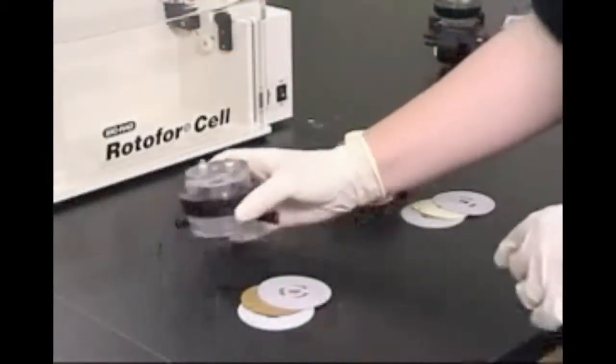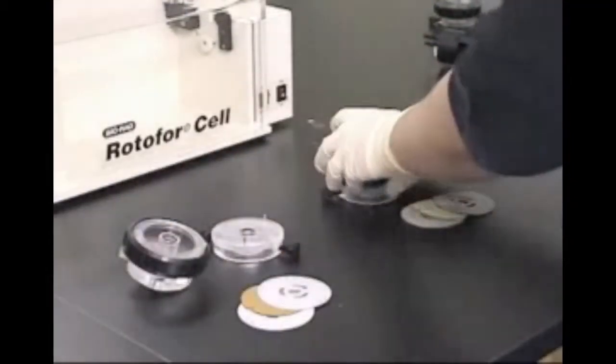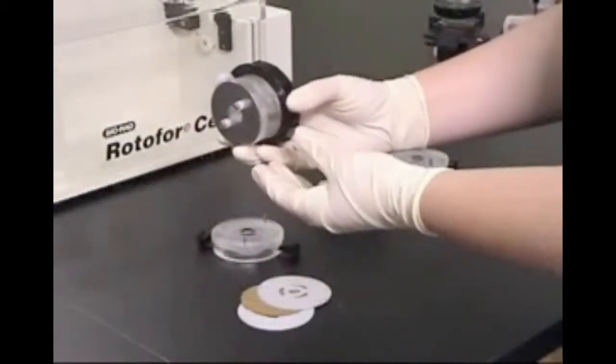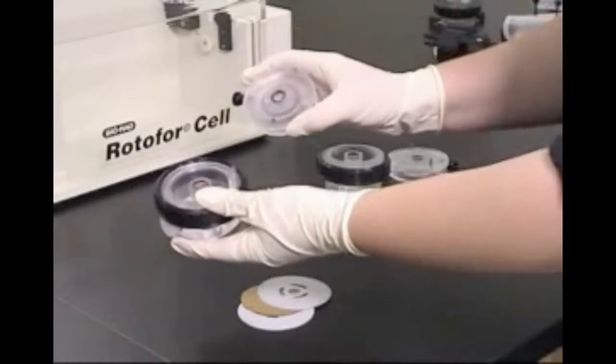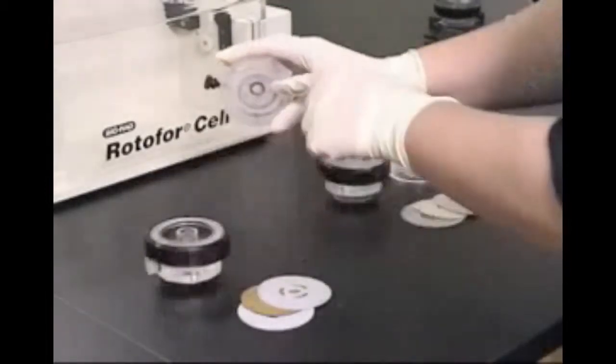Each electro chamber has two components. The inner and outer components fit together to provide a chamber for the electrolyte solution. The outer components are identified by a black captive sleeve, and the inner components have two alignment pins that match up with the outer component.